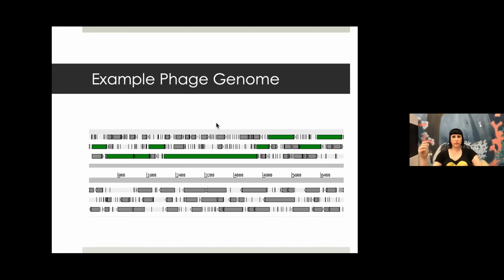So the first thing you will notice is that the green coding ORFs tend to be much longer, but not always. So this tells us that length is important. The next thing you'll notice is that the coding ORFs are all in the same direction, which is also important. And lastly, you might have noticed that for the most part, when one coding ORF ends, another begins. So using this knowledge, I came up with a model to follow an optimal path through the genes of the genome, thereby annotating it effectively.